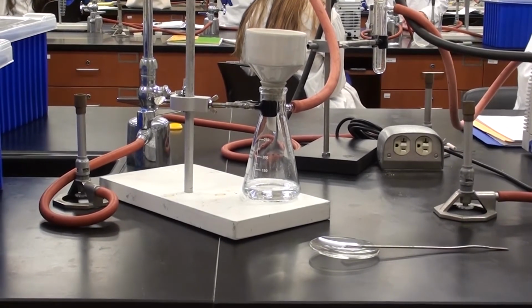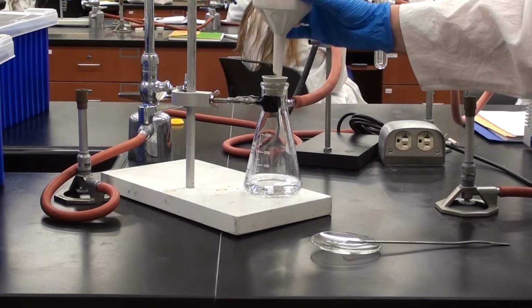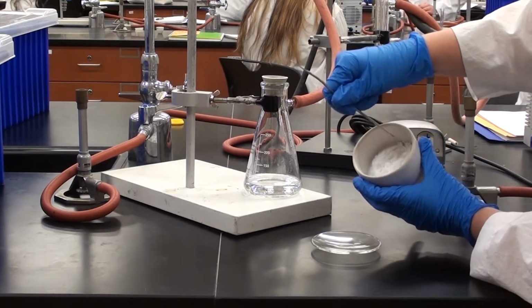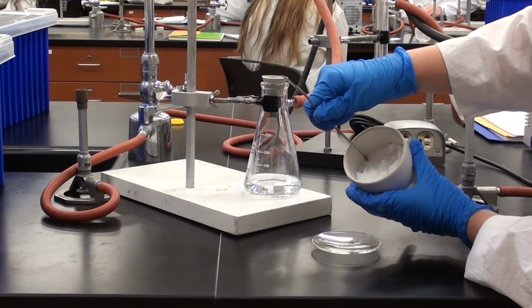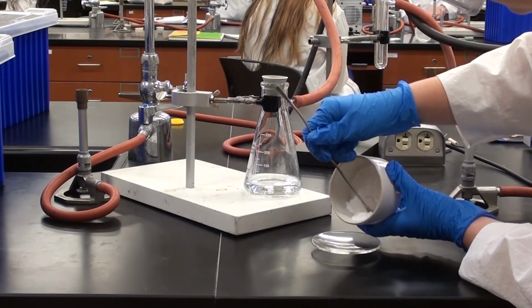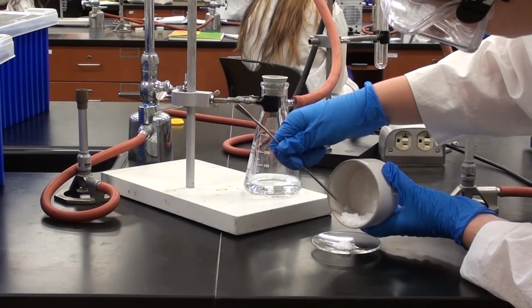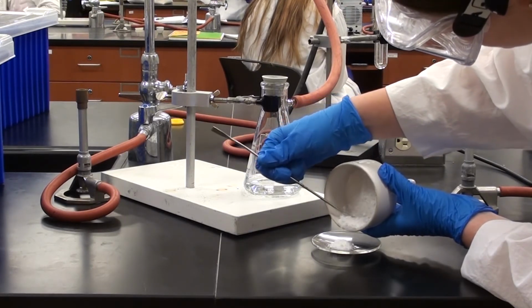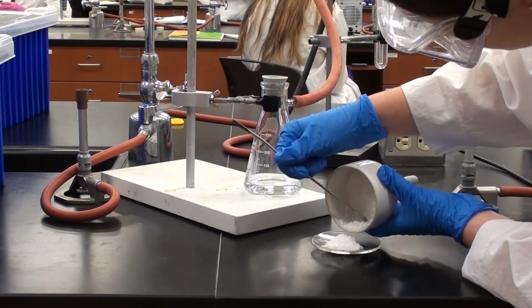So it's been filtering for about 10 minutes now, and Cassidy's going to go ahead and take out the solid and put it onto a watch glass. Now this is not too bad as far as purity goes. We are going to take a melting point of it as well, and we'll get to see what the melting point is, but it hasn't been recrystallized, so it may not be as pure as what we got for the salicylic acid. But she's going to go ahead there and scrape out the solid, and she's going to make sure she doesn't scrape off the filter paper too much, and then she'll take the mass of that and get a melting point.